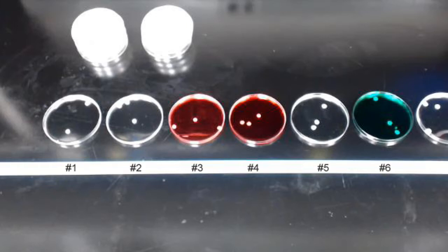However, I numbered them, and so each plate that you're going to be seeing here has a number assigned to it from left to right. The leftmost plate is number 1, all the way to the rightmost plate, which will be number 12. I'm going to read off what each antimicrobial is by number. Number 1 is 70% ethanol. Number 2, 70% propanol. Number 3, 5% phenol. Number 4, 10% phenol. Number 5, 1 molar silver nitrate.